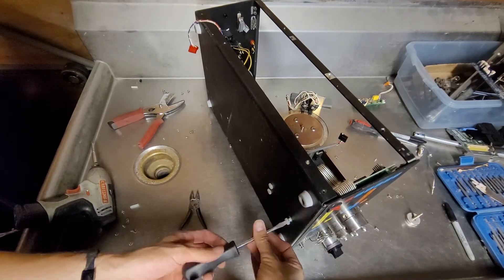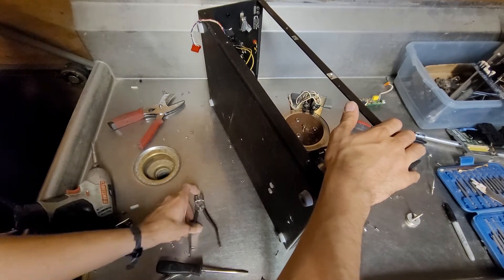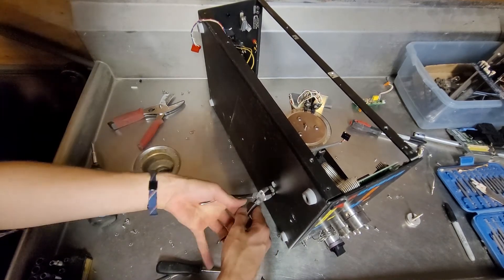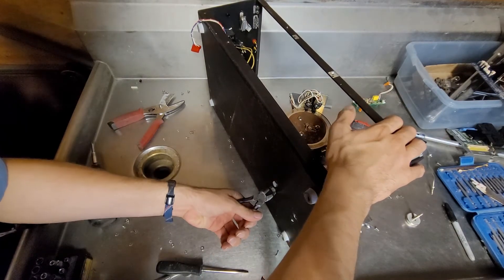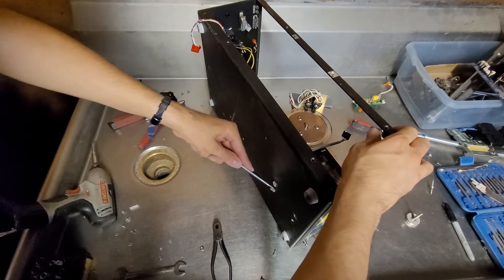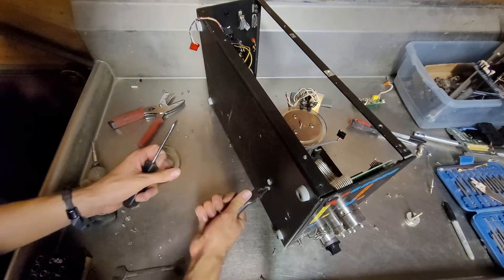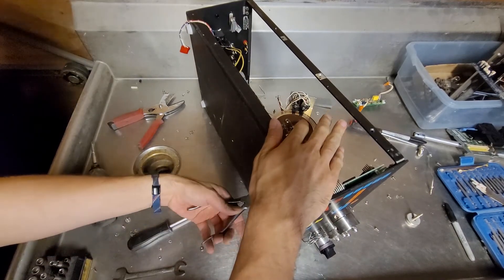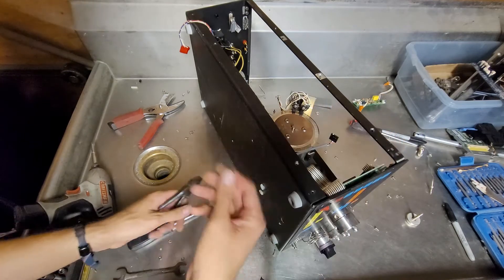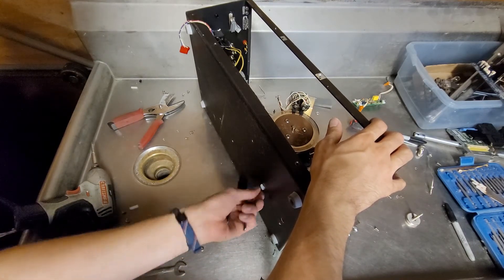There we go. Oh man, just kind of doomed for failure there. It probably doesn't help that I have this on its side while trying to mess with these, since it's putting them under a load.